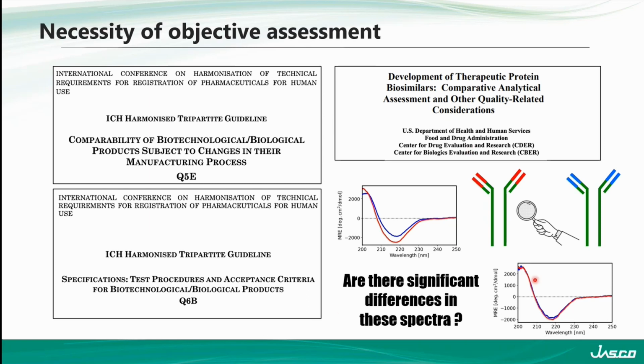So in the bottom right here, we have two spectra, one in the red, which belongs to what I'll call our innovator product, which is basically a product that has existed on the market a while, it's well established. And then we can have now this blue-tipped monoclonal antibody, which I'll call our biosimilar, which is basically the common language used to describe these types of derived materials.